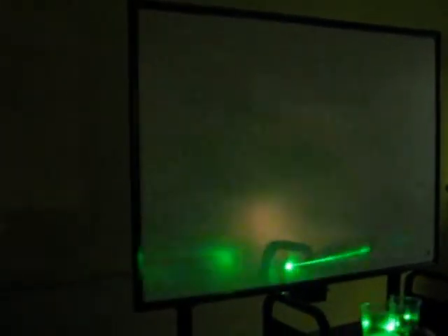I can't see. I think that might be a paramecium. Red light. I didn't plan that. Okay. There's your egg.